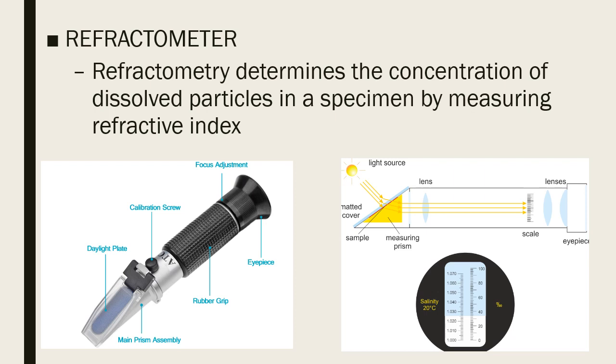But with that, you start at 1.000, and per graduation you add 0.005. Okay, so it will follow 1.000, next will be 1.005, then 1.010 also. Okay, and so you have there.